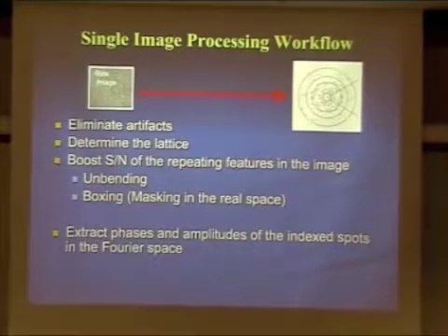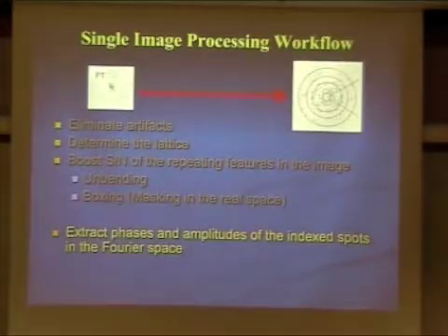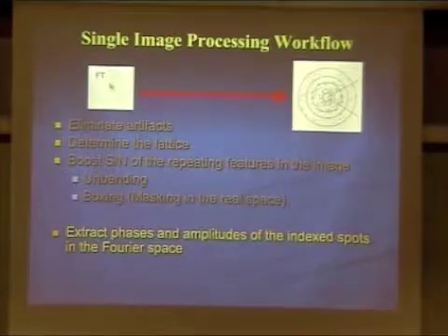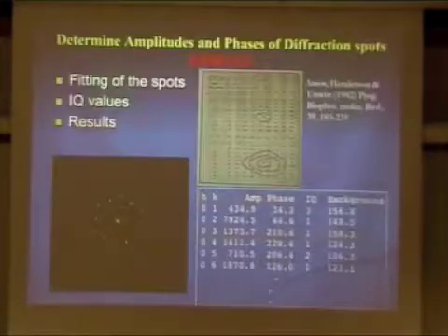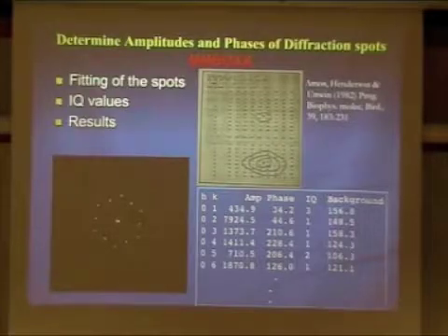So the way I'm going to describe this is always going a bit backward. The first thing I'm going to talk about is how the phases and amplitudes are extracted, so that when you look at the other parts, you see why we are getting improvement. In the handout, the order is reversed, so you can find it a little bit at the end of it.